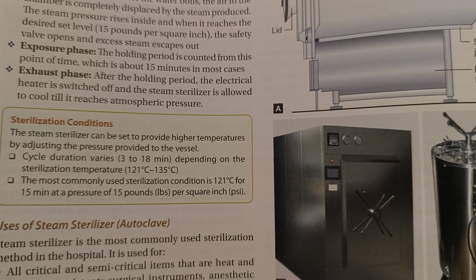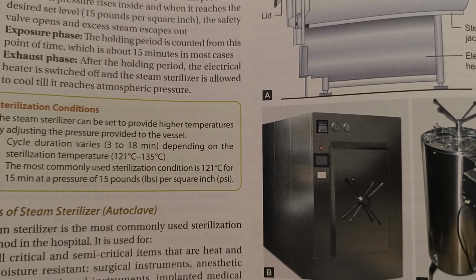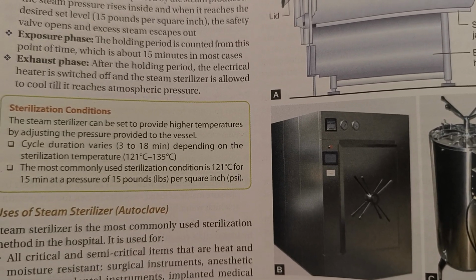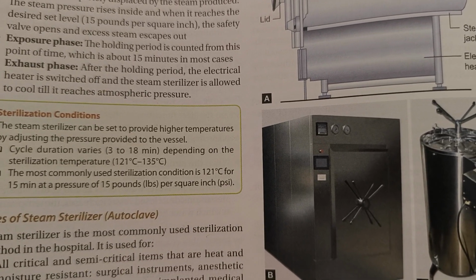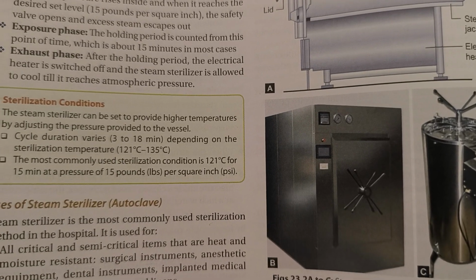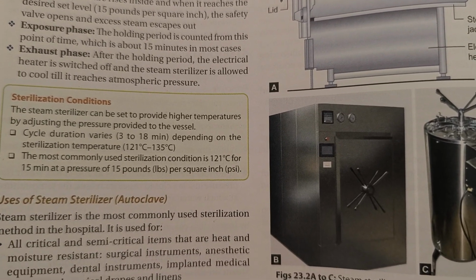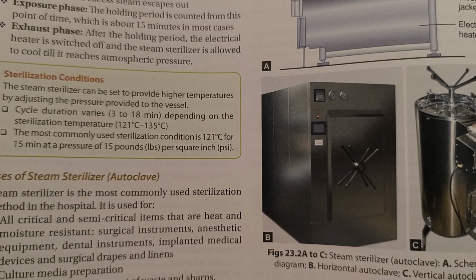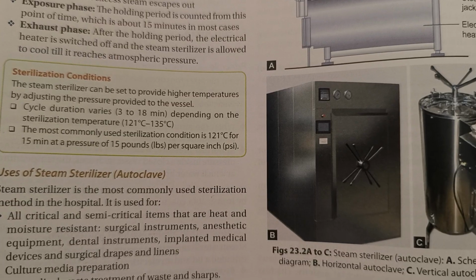The steam pressure increases inside. When it reaches the desired set level of 15 pounds per square inch, the safety valve opens and excess steam escapes out. Exposure phase.